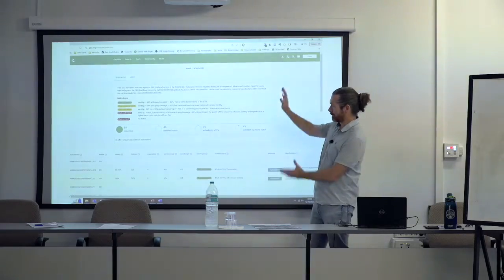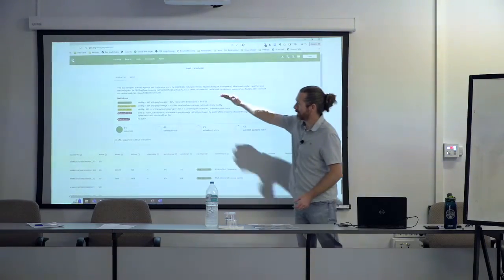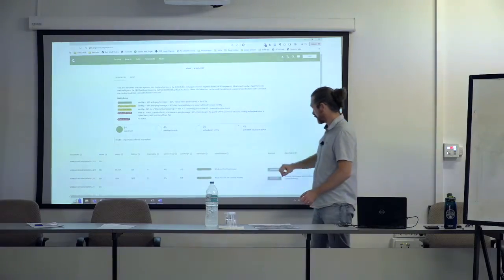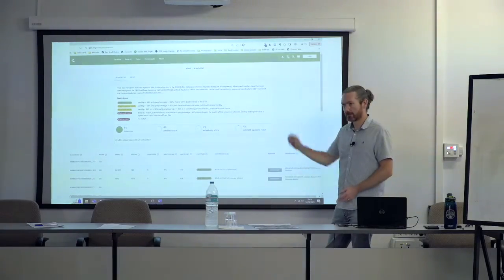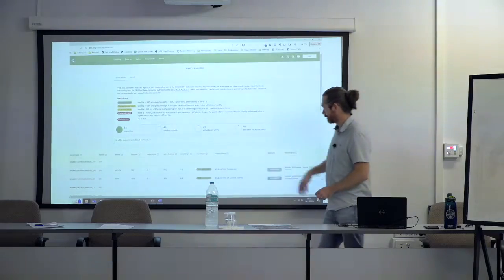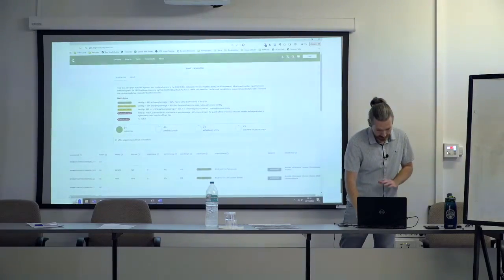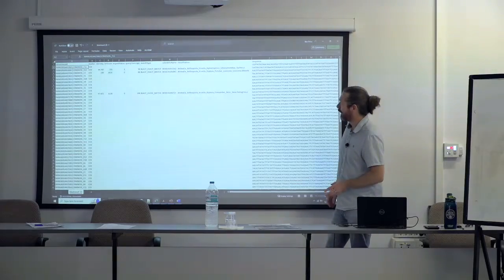Imagine it's done all of them successfully. It gets to the end here, and it tells you how many it matched at each level. And you can then just go and download. In the bottom corner, there's a little download the CSV file. And so you'll get a spreadsheet with all of these matches. So that's that. When it is working, it's beautiful.